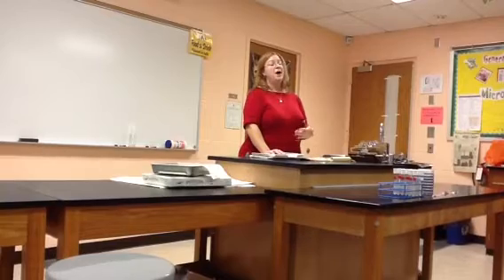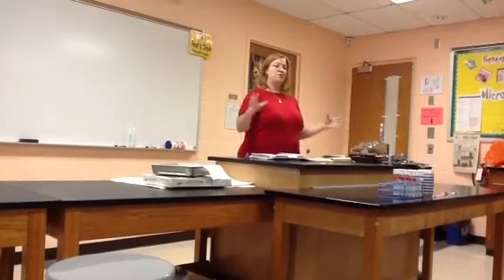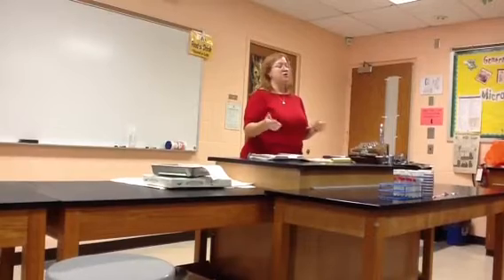So you're going to learn what most labs do. We do a metabolic profile. We find the bacteria from that mixed culture that we think might be the one causing the problem, and then we figure out what kind of food does it eat, what kind of waste does it make, what kind of byproducts does it make, and by looking at that whole profile of its food and its waste, we narrow down which bacteria it is. Okay?